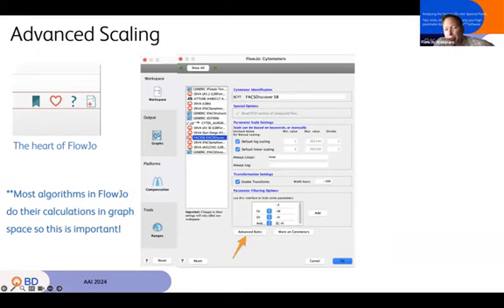Importantly, we only display the cytometers that you've actually loaded data into FlowJo from. No reason to show you a whole bunch of cytometers you don't use. It makes it easier to find the ones you actually do use. So if you pick the cytometer that you're using, and here I'm going with the 50 color panel, I'm using the FACSDiscover S8 as my example.